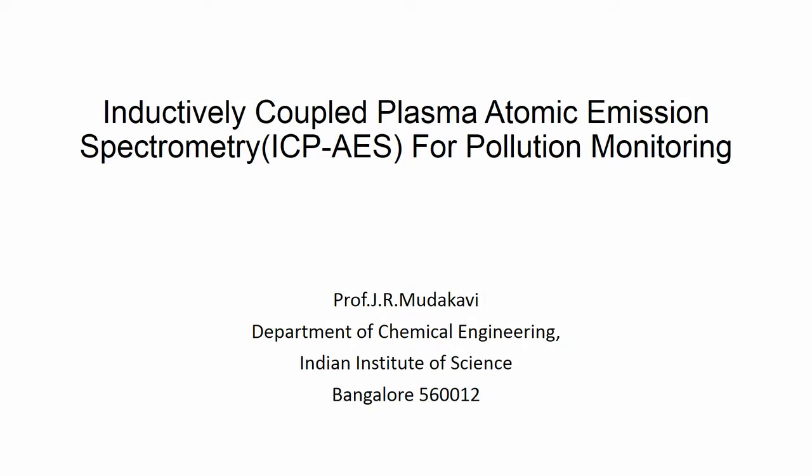In this course, that is inductively coupled plasma atomic emission spectrometry, in short ICP-AES, for pollution monitoring, I would like to introduce you to one of the most modern elemental analysis techniques, which is basically an extension of a series of optical spectroscopic techniques developed since the 1930s.